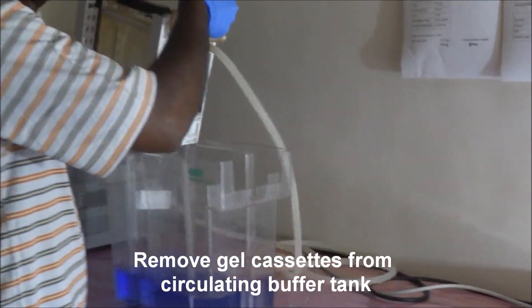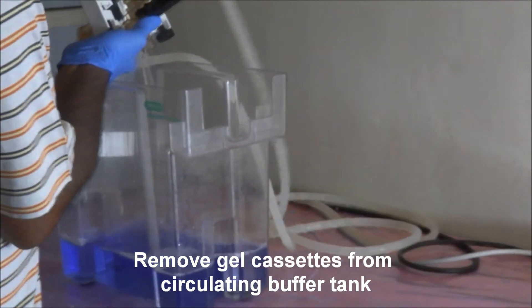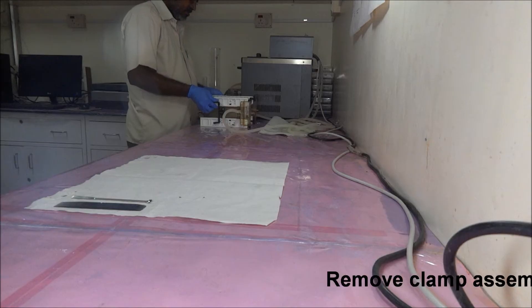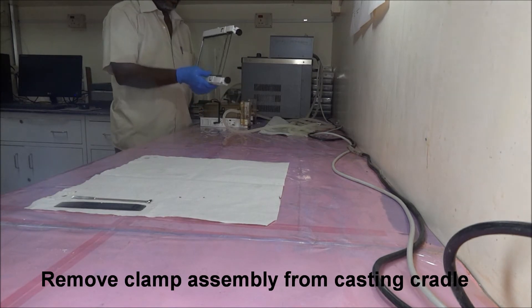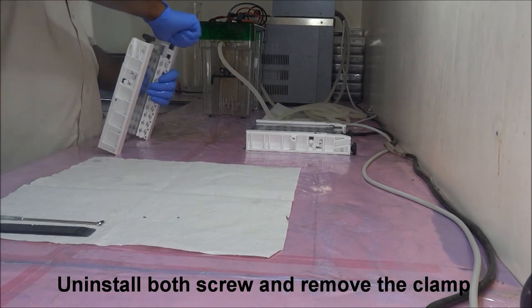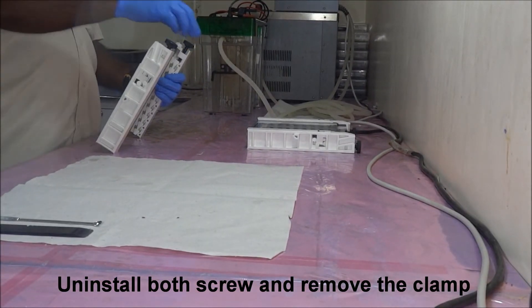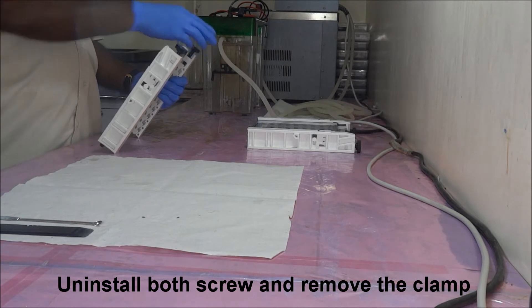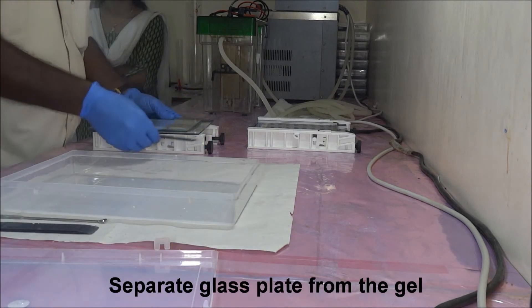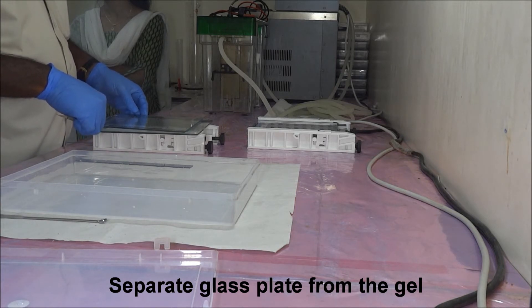In the first step of silver staining, gently remove the gel cassettes from the circulating buffer tank. Remove the clamp assembly from the casting cradle. Uninstall both screws, remove the clamp, and remove the gel. Carefully separate the glass plate from the gel with the help of a gel separator.